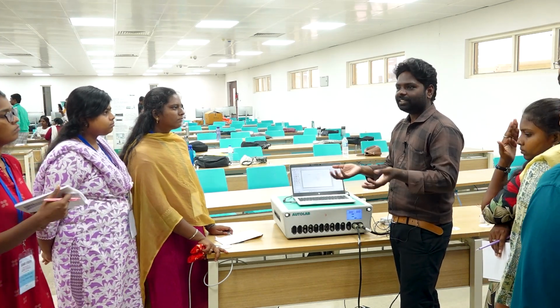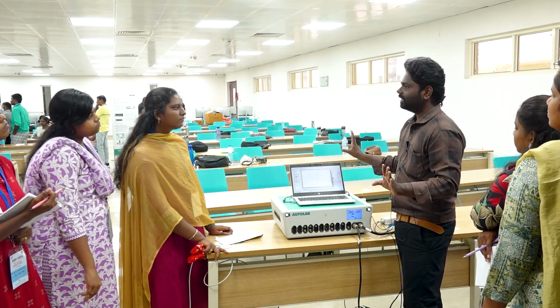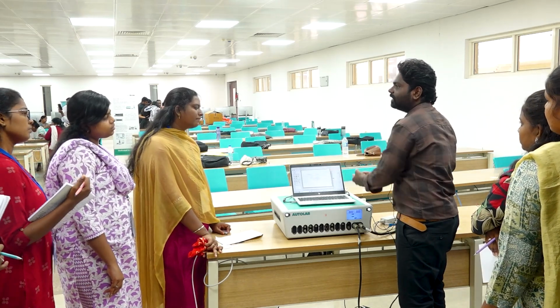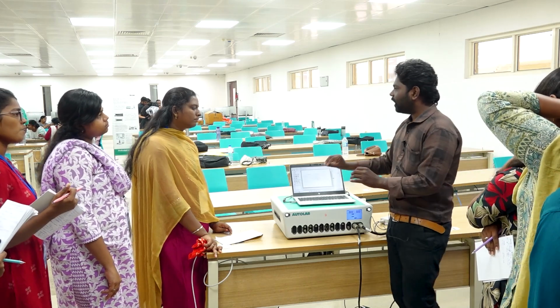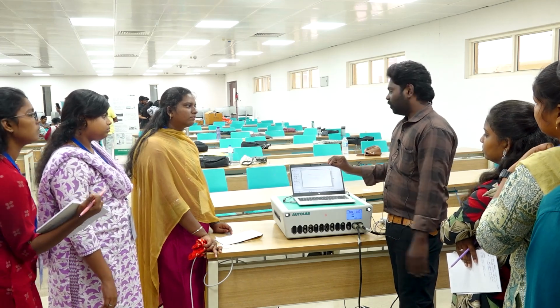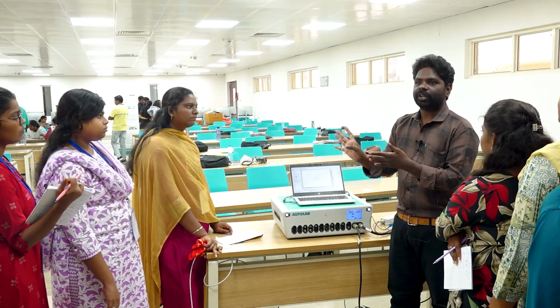Getting data is very easy. We can simply connect the sample and press one run button. That's it. After getting the data, the interpretation is what? We have to create an equivalent circuit. Then only we can get the exact values. Without drawing the equivalent circuit, we won't get any values. So for that, we need to know how to draw a circuit.